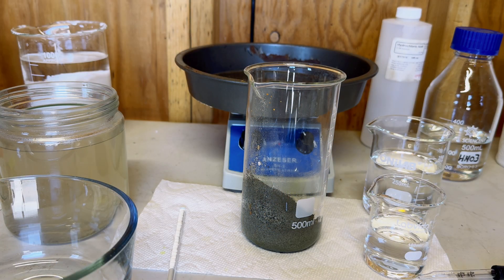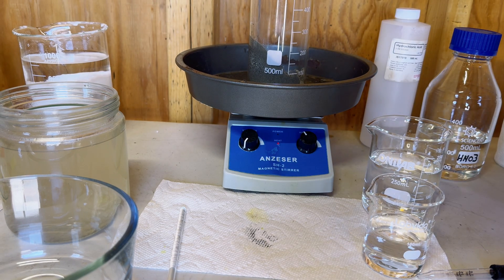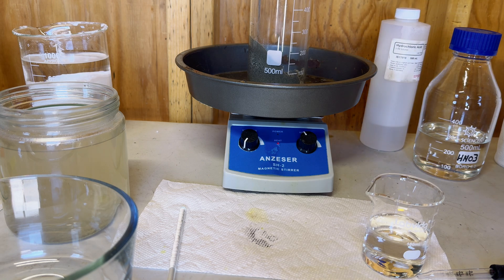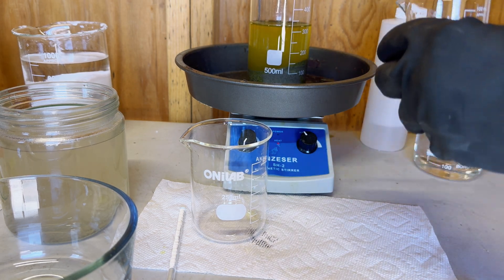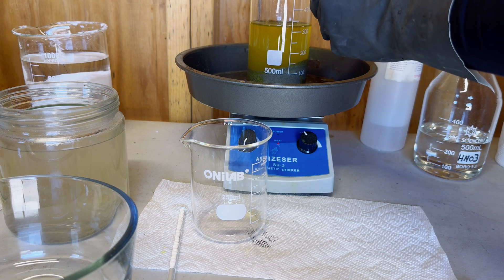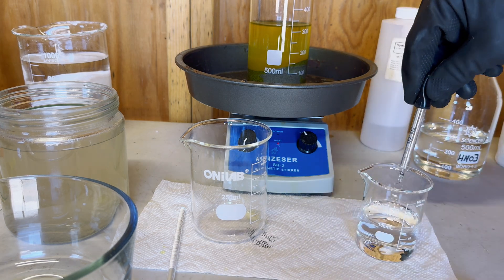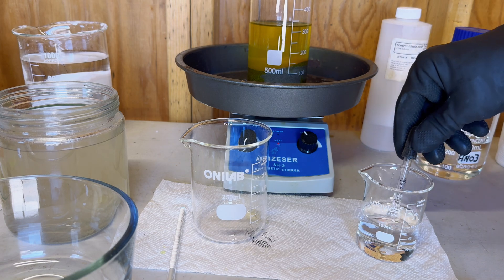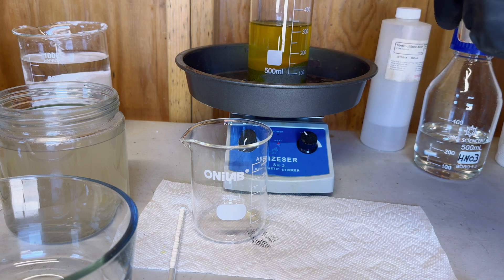Now we will make our aqua regia, and we will start with 200 milliliters of hydrochloric acid and 3 milliliters of nitric acid. I am using a small measuring pipette to add in our nitric acid into our solution. I am going to add in an extra 1.5 milliliters of nitric acid into our solution.